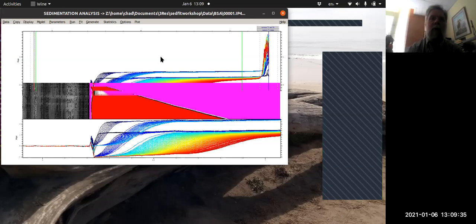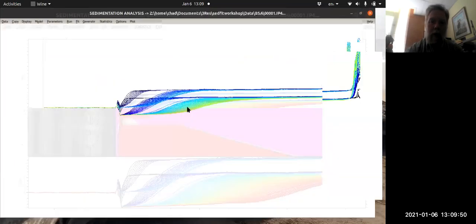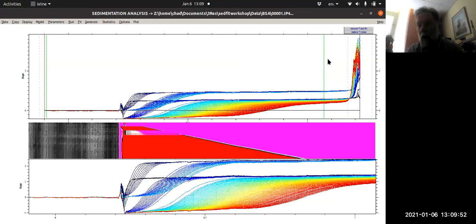But there was a time with the Proteome Lab instrument, a couple of years ago, where they managed to screw up the timestamping of their actual data. And it means that all your data looked like garbage. You got the wrong S values, you got the wrong molecular weight, because things that were happening at 1 hour and 10 minutes were really happening at 1 hour and 30 minutes. They were off by a lot.